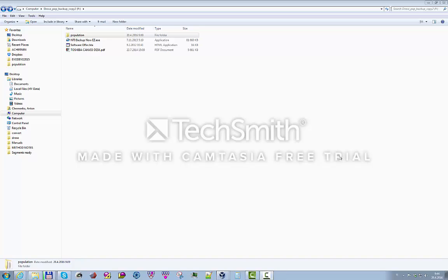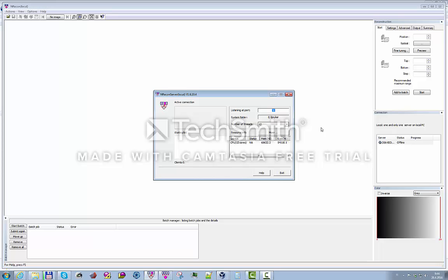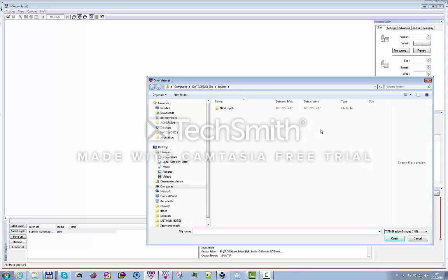Alright, welcome back. We continue with NRecon. NRecon looks like this. We are going to open it now. Let it establish a connection with the NRecon server. And that's done. Okay, let's open the data.